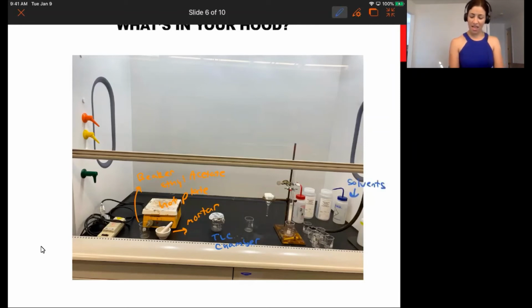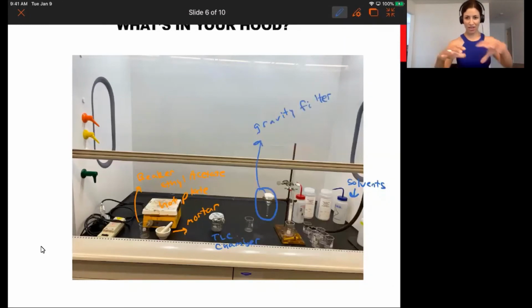Once you have your 1 ml solution, your dissolved solution, your gravity filter will be set up on a ring stand so that you do not have to juggle too many things in your 2 hands. And your clean beaker will be adjacent to it. You can go ahead and carry out the gravity filtration, and then you're ready to add that 1 ml solution onto your column.